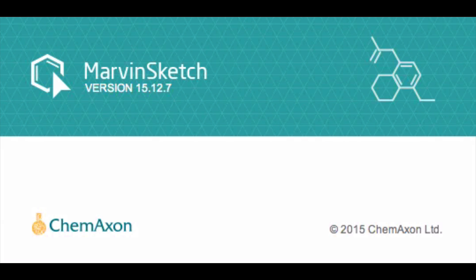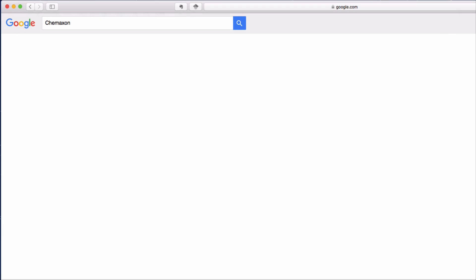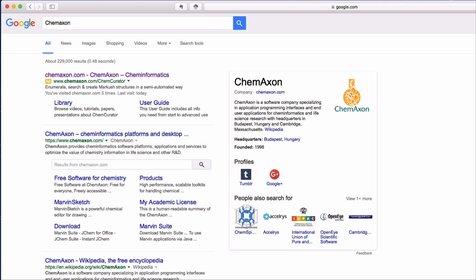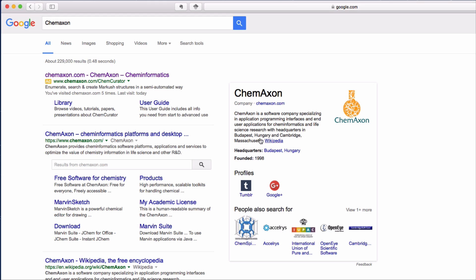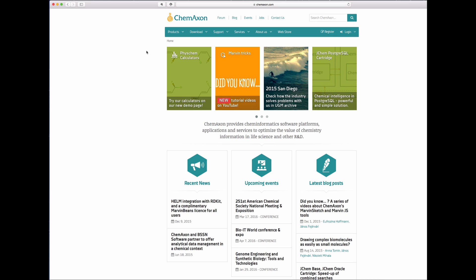MarvinSketch is a useful resource for discovering and investigating chemistry. It is freely available for academic purposes, but you will need to register on the ChemAxon website.